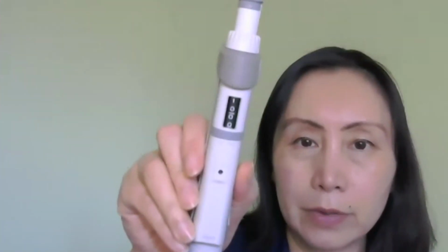So I adjust the reading to 1000. That will be 10 microliter. Now I got it, you can take a look. So that's 10 microliter, and I got the tip.